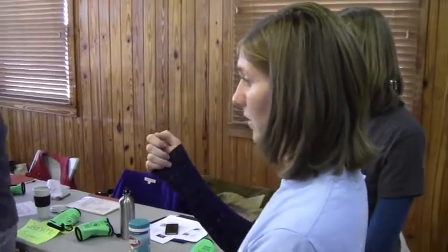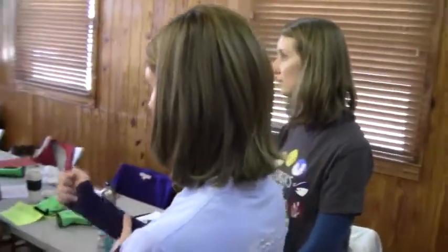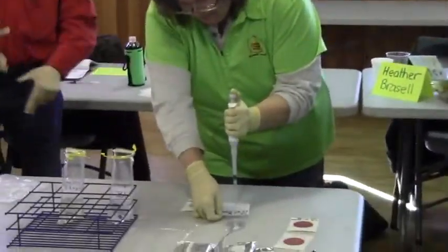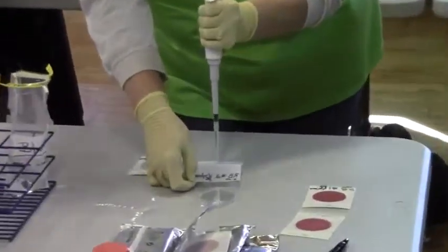You only want to go to that first stop to draw your sample out, and then when you're expelling it onto the plate, that's when it pushes a little extra to make sure everything comes out. So you draw it up with one stop and then push to the first and then finish pushing all the way to the other. There's just a little pause in between the first stop and the second when you're delivering, like Julie's doing right now, because you want to be gentle and make sure you don't push it all the way down immediately.